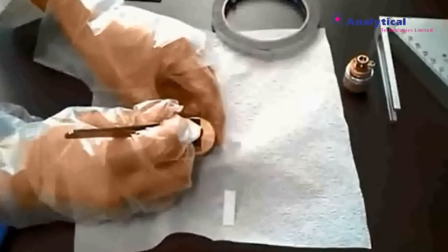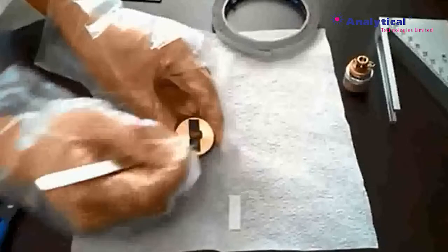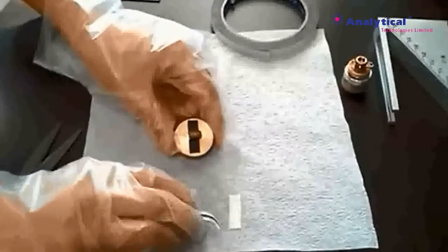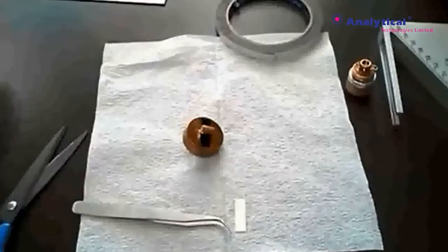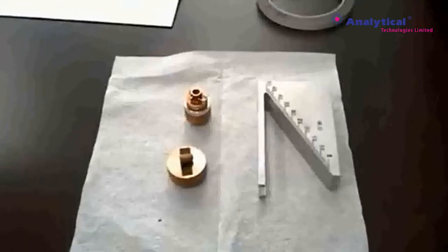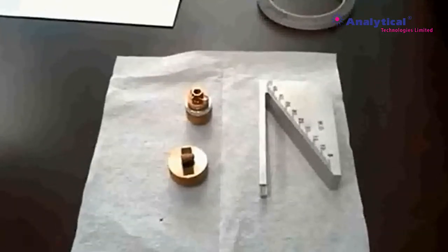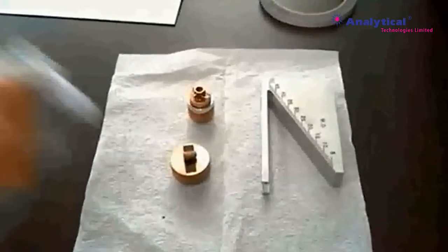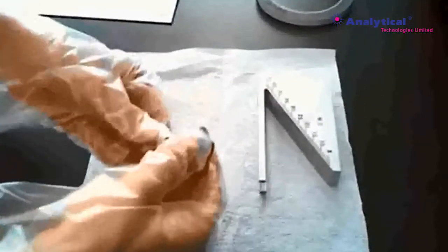In the case of insulators, correct SEM observation is difficult due to electrification. Therefore, proper pre-processing is required to use the SEM. Then, combine the stub and the specimen holder. Estimate where the sample is located according to the ruler.